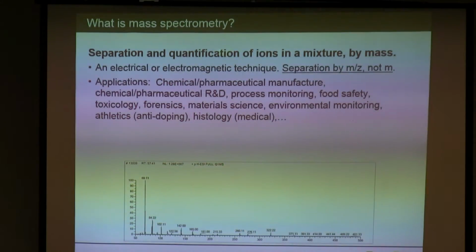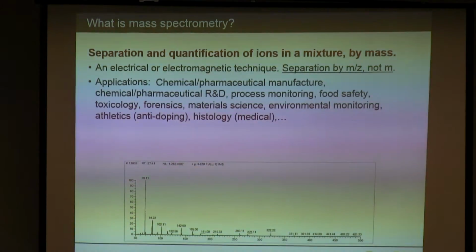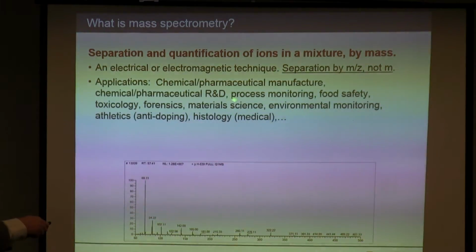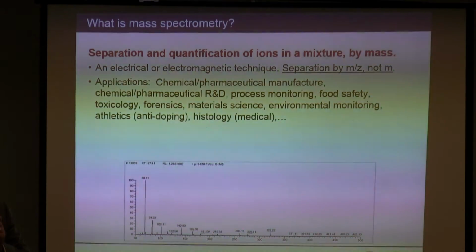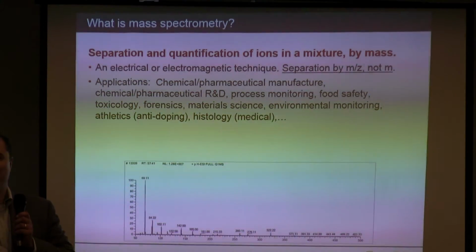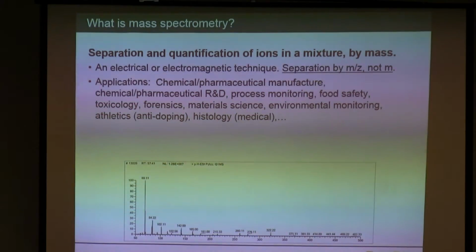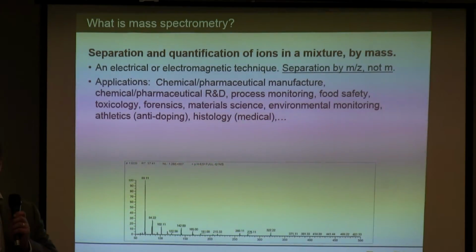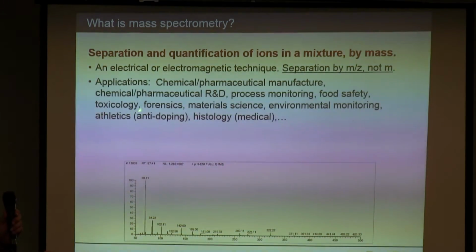Applications: chemical and pharmaceutical manufacturers, the obvious one. You have synthesis, how much did I make, isn't really there. R&D, what did I make, and again, how much. Process monitoring, food safety. Our little water bottles in this room say it's enhanced with minerals for fresh taste. You want to make sure that it's not perfluorooctanoic acid from DuPont, which may be very tasty, but it's not safe. Actually, some of this is used for monitoring of imports for contamination and forbidden additives, for example.